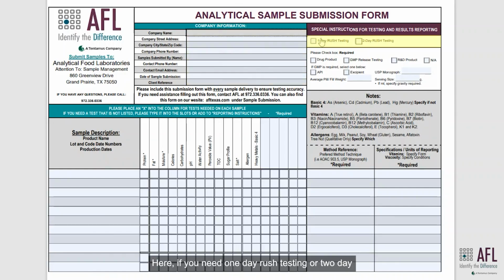Here, if you need 1-day rush testing or 2-day rush testing, please check these boxes, but also let us know. Contact sales or chemistry management, Dr. Wuller and Anita Fluick, to confirm that we can meet the rush testing before you send it in. If you send it in without confirming, we will try our best to meet it, but we will not guarantee to meet that testing unless we validate that we have the right equipment and chemicals on hand to do your testing.